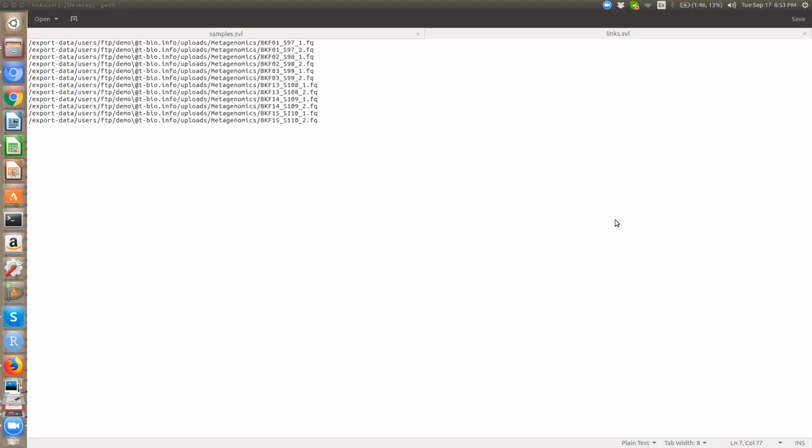So Arvind has asked the question, can we call the identified entities species? Yes, that is the whole idea, to identify and classify them into different species. Yeah, paired end 1 and 2. So 1 and 2 both, so paired end. That's why there are two sets of FASTQ file. One is this, and the same accession number followed by _2. So these are paired end reads in the server.